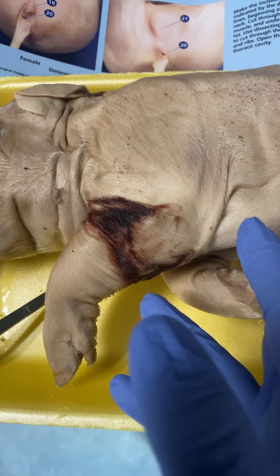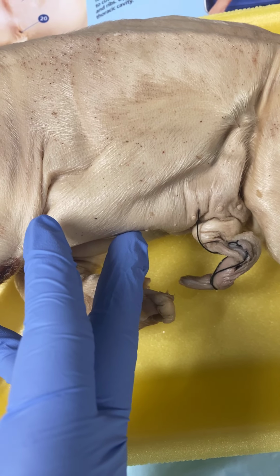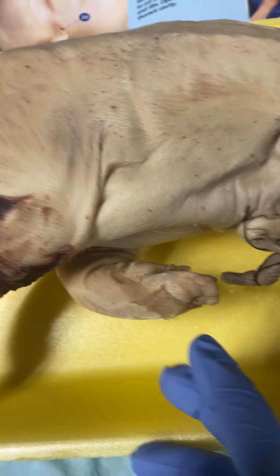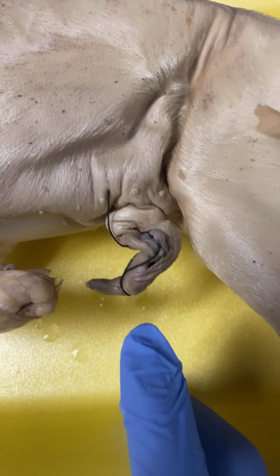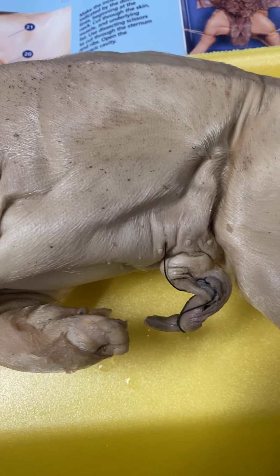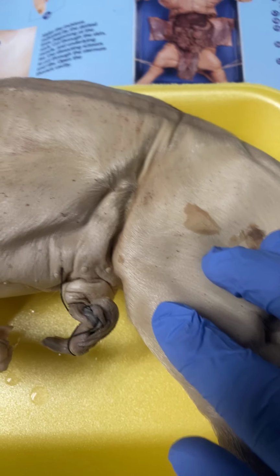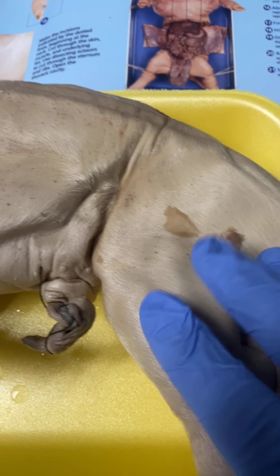Next are the teats. You can see them right there. They are paired mammary papilla, or the nipples. Next is the umbilical cord. This is right here, and is tissue that connects the fetus to the placenta. Next, you have the knee right here, and is the joint on the hind limb at the junction of the femur, the tibia, and the fibula.